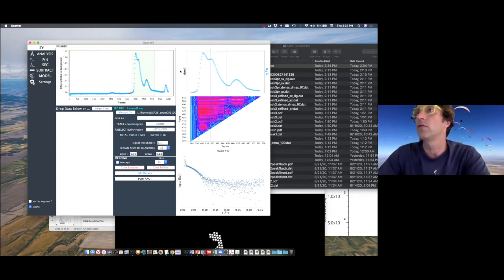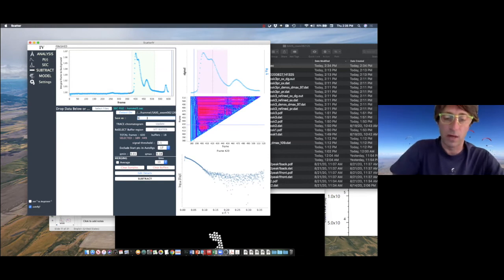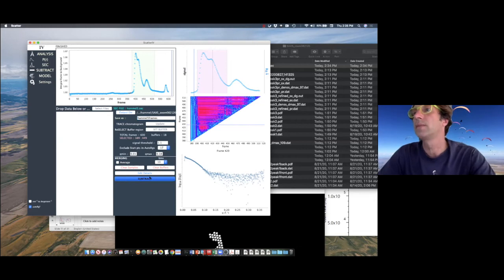Let's just focus on this region of the split peaks, because this peak is very far away from that region here, and I do not expect that this small molecule really interacts with this one. So what you can do is select the region that you're going to use for deconvolution. I think it's going to be right. And say, whatever, five frames. And when you hit subtract, it shows up.